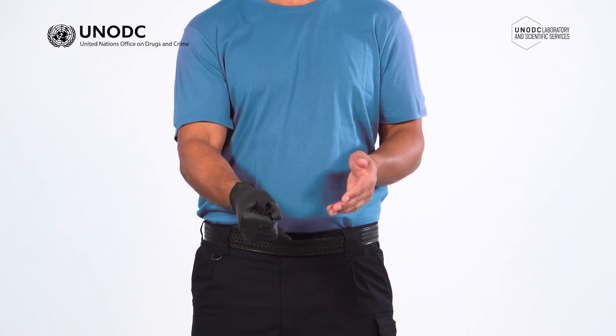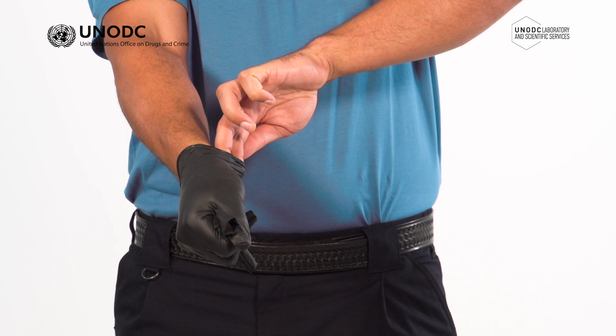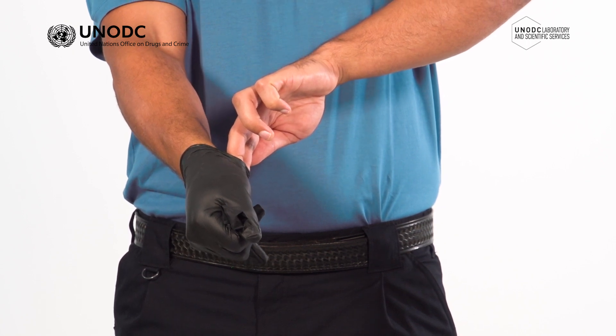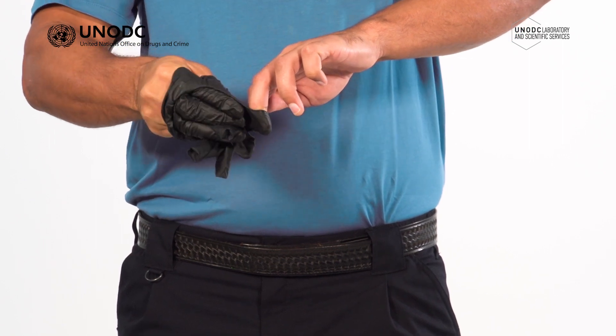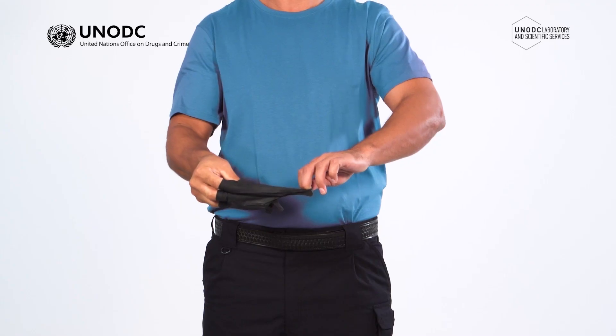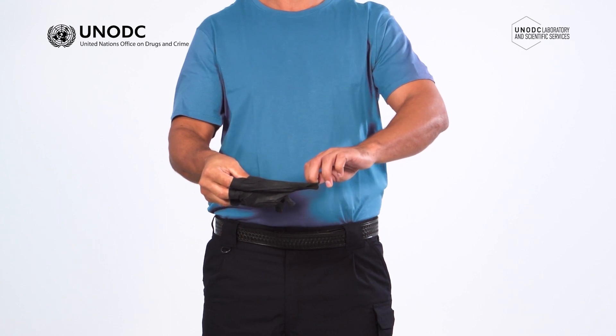With your ungloved hand, slide your fingers under the cuff of the other glove. With the first glove bunched securely in your palm, peel the remaining glove downward away from the wrist, making sure you do not touch the outside of the glove. Remember your hands must only touch the inside of the gloves, never the outside.